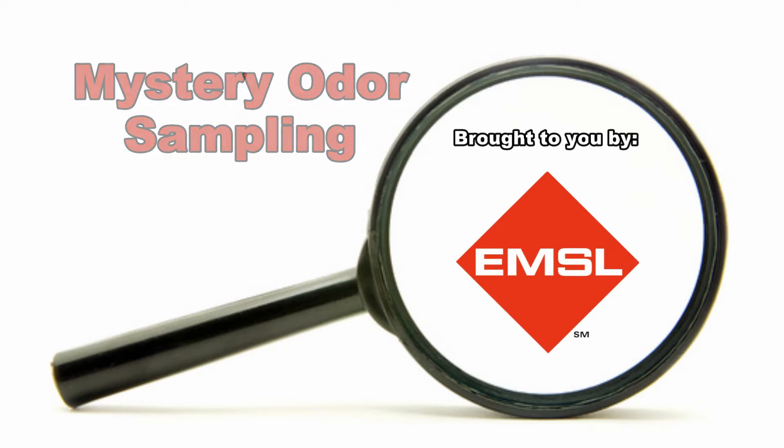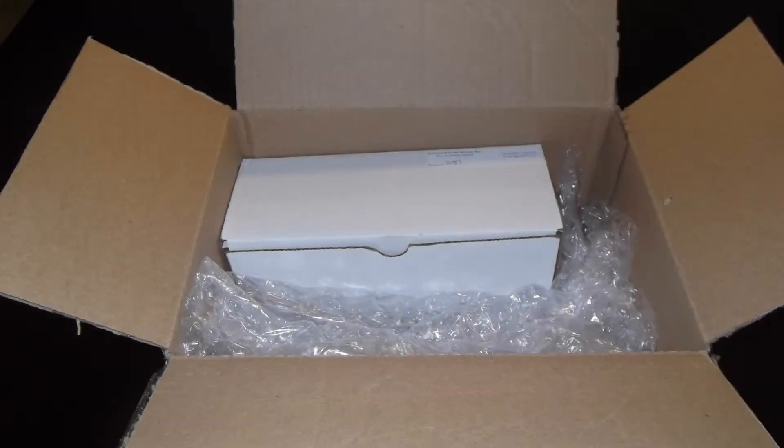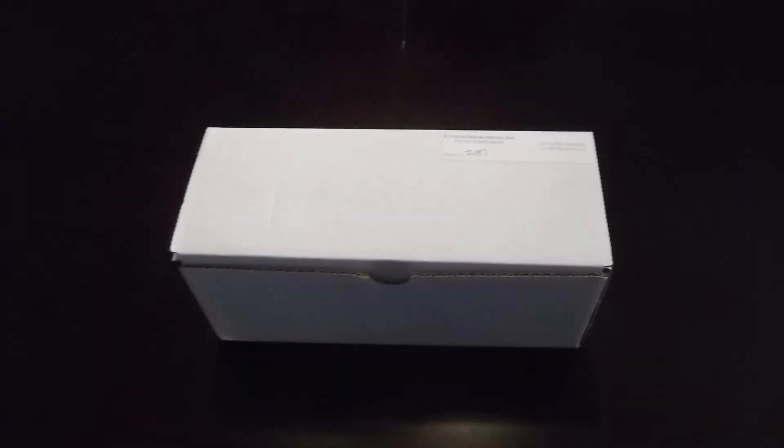This video describes how to sample for a mystery odor. When the sampling equipment has arrived, open the package and remove the contents.